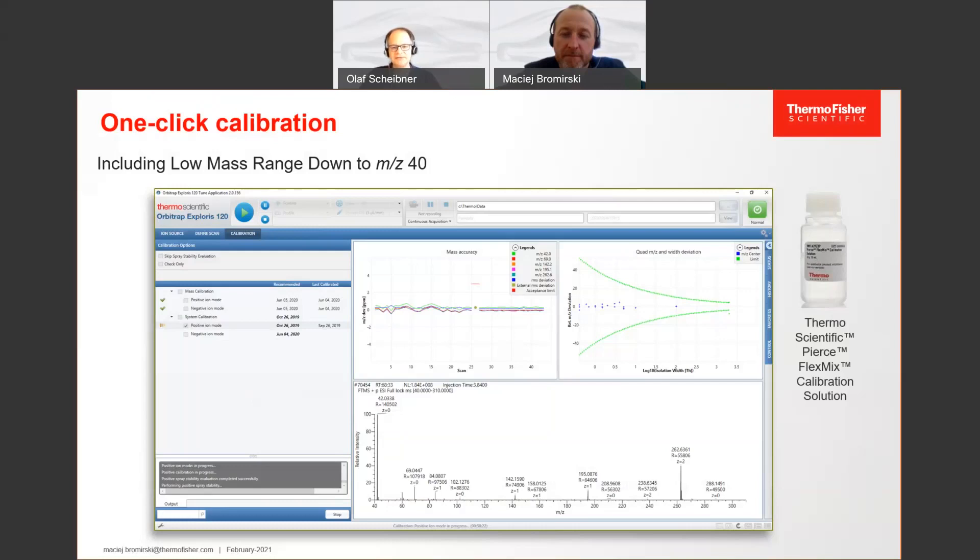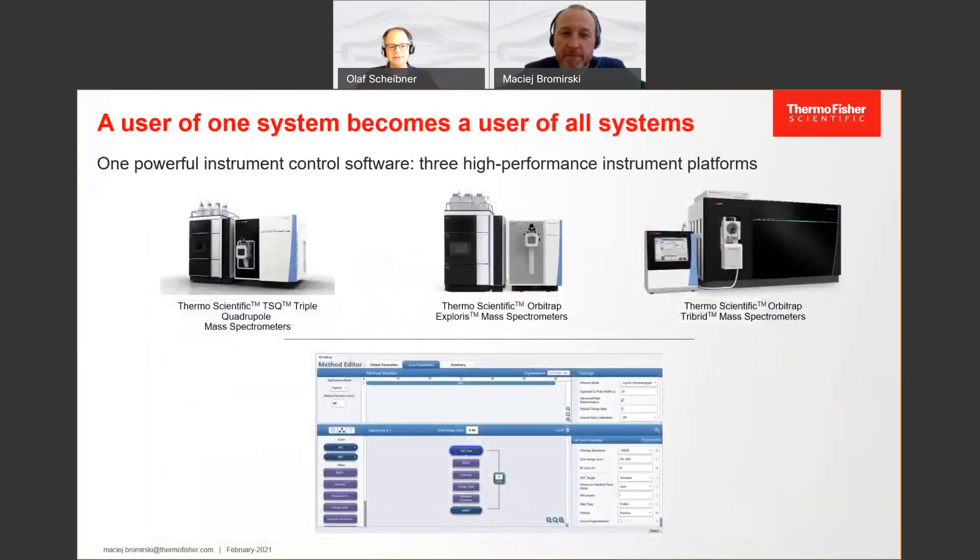But it's not only the mass calibration that has become easier — it is the full method editor that has changed. As mentioned before in the series, as a user of one system, you become the user of all systems. It is the same instrument control software in the background, the same design of the method editor between the instruments. Although they have certain different functions — an HRM instrument is different from a triple quad — the operation is very similar, so you won't have any problems switching from one system type to the next.